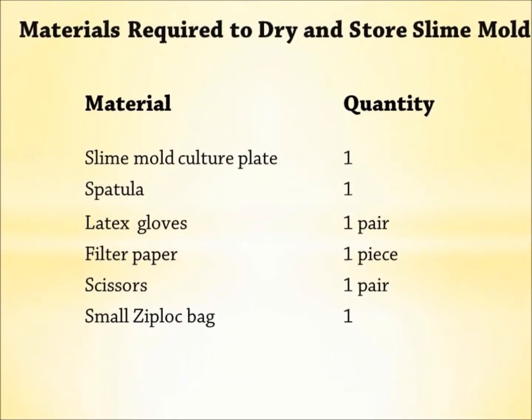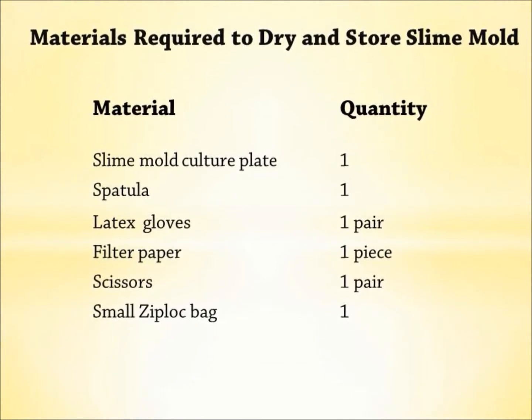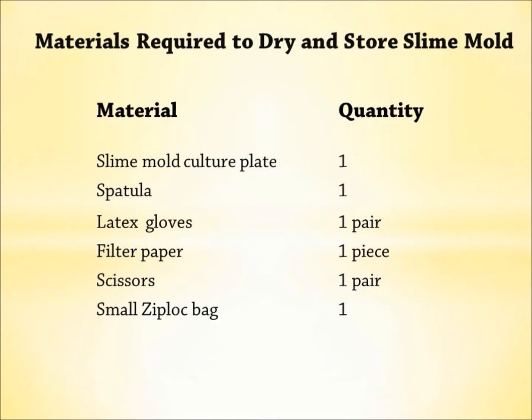This video will show you how to prepare dried samples of slime mold on filter paper for long-term storage in the freezer.